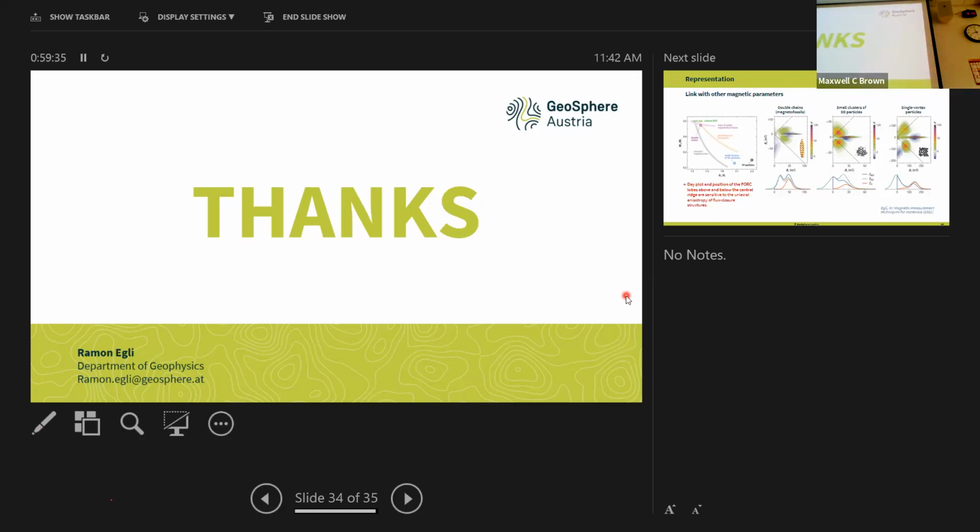More technical question. You can go on. Okay. So another question is regarding the size of the sample. You said you don't want it to be too long, you want it more round, like a ball, so you can really center it in the middle. Yes. And on the other hand, especially with very weak magnetization, we want as much material as possible. So we started putting a lot of material on the side, and then we have this all elongated. So I think maybe that's not a good idea according to what you said.